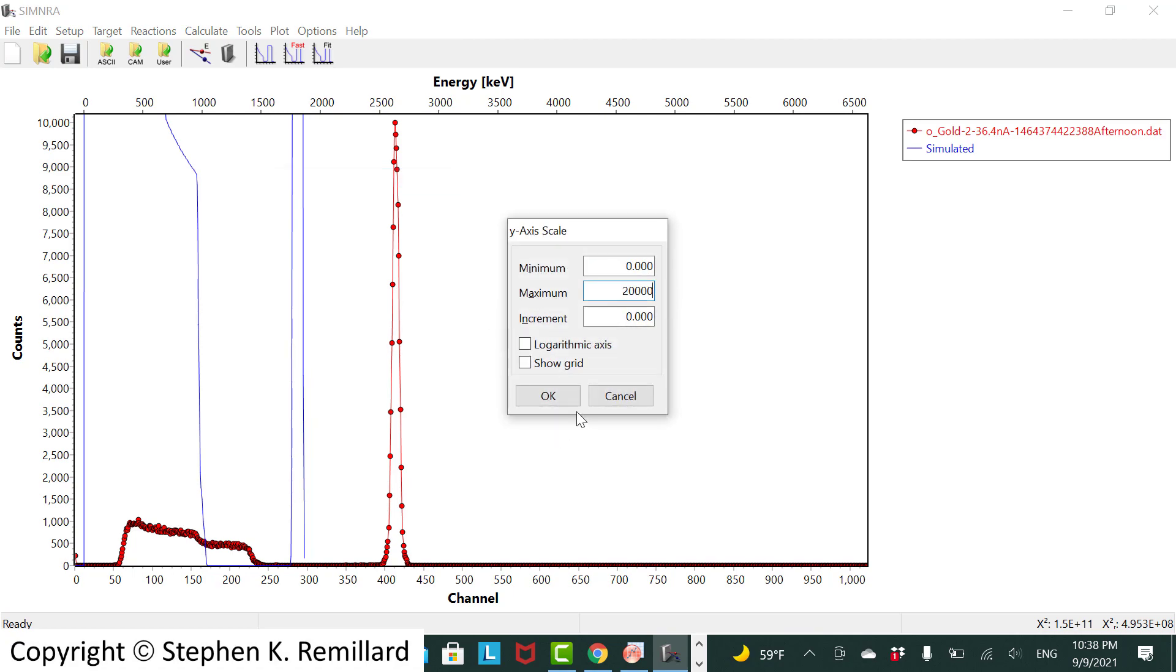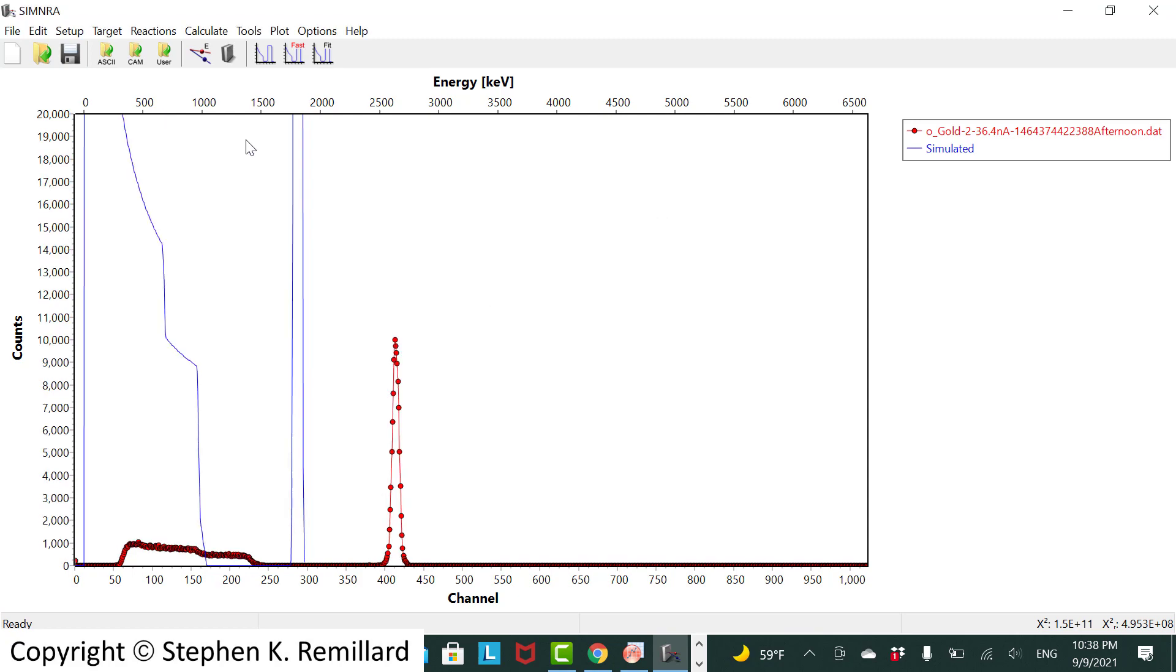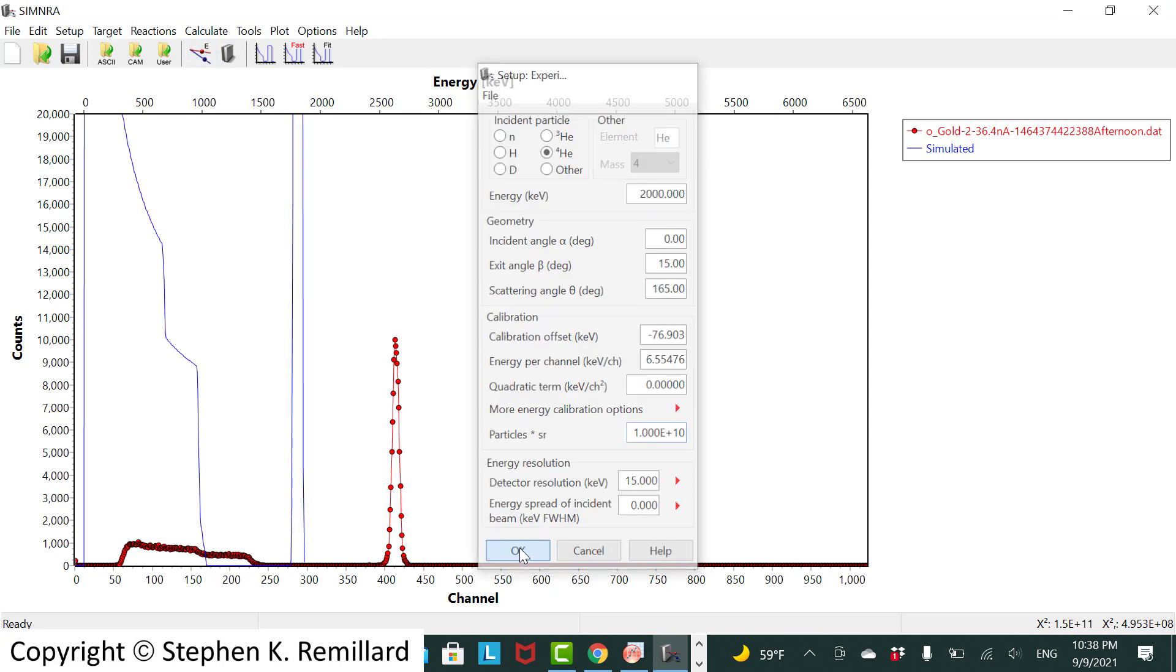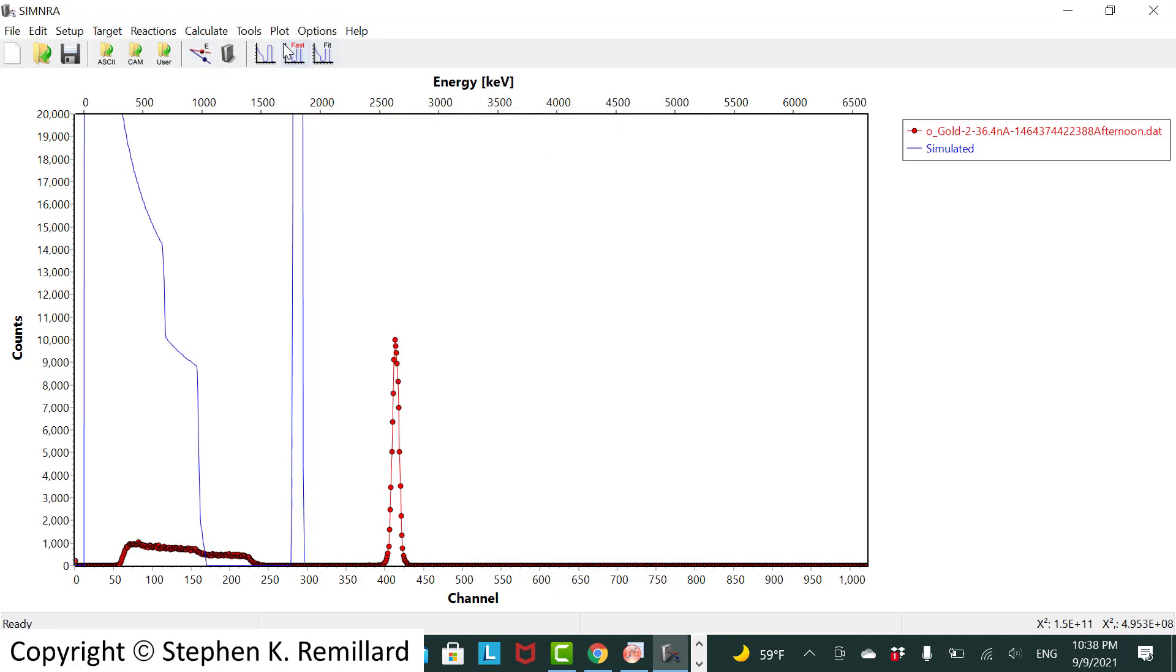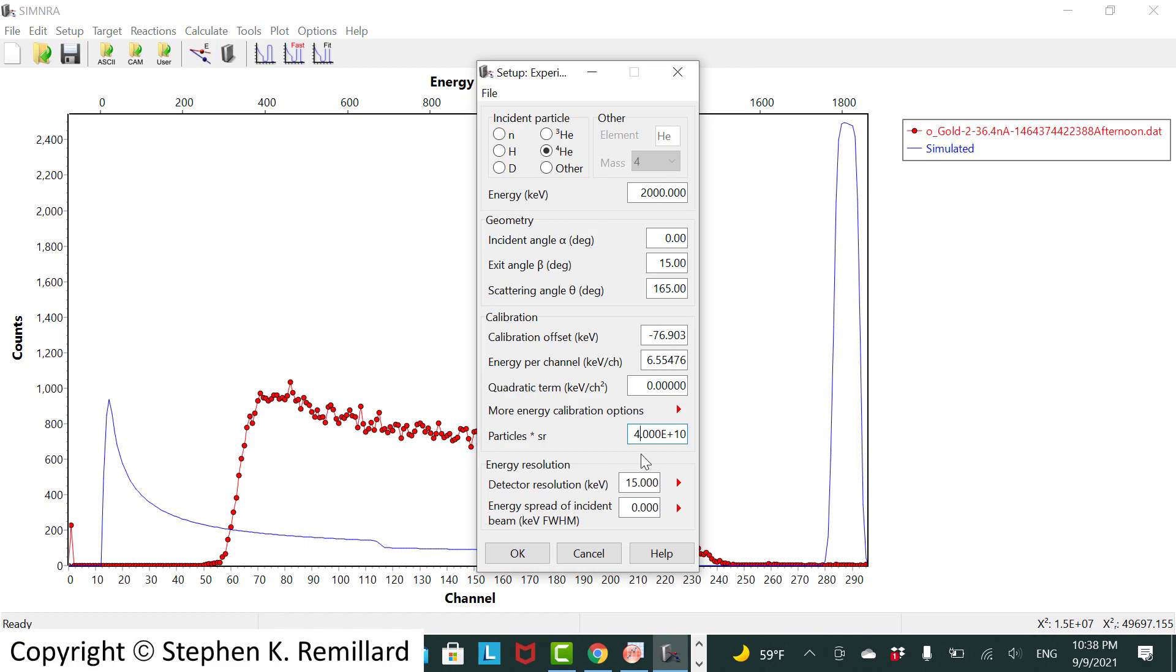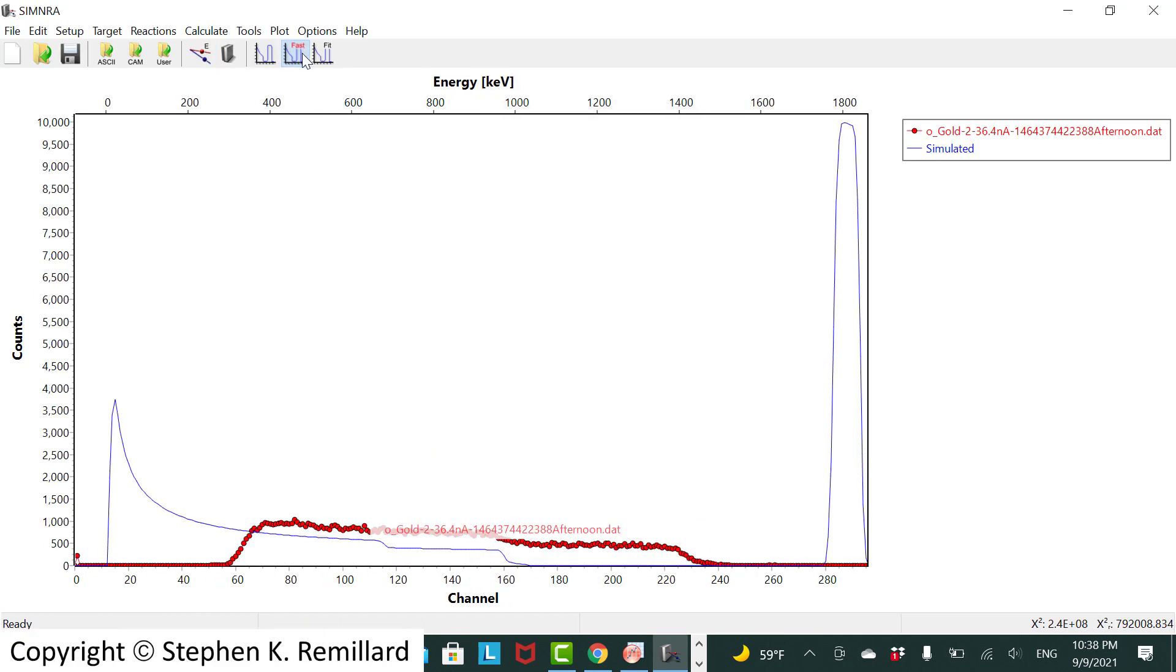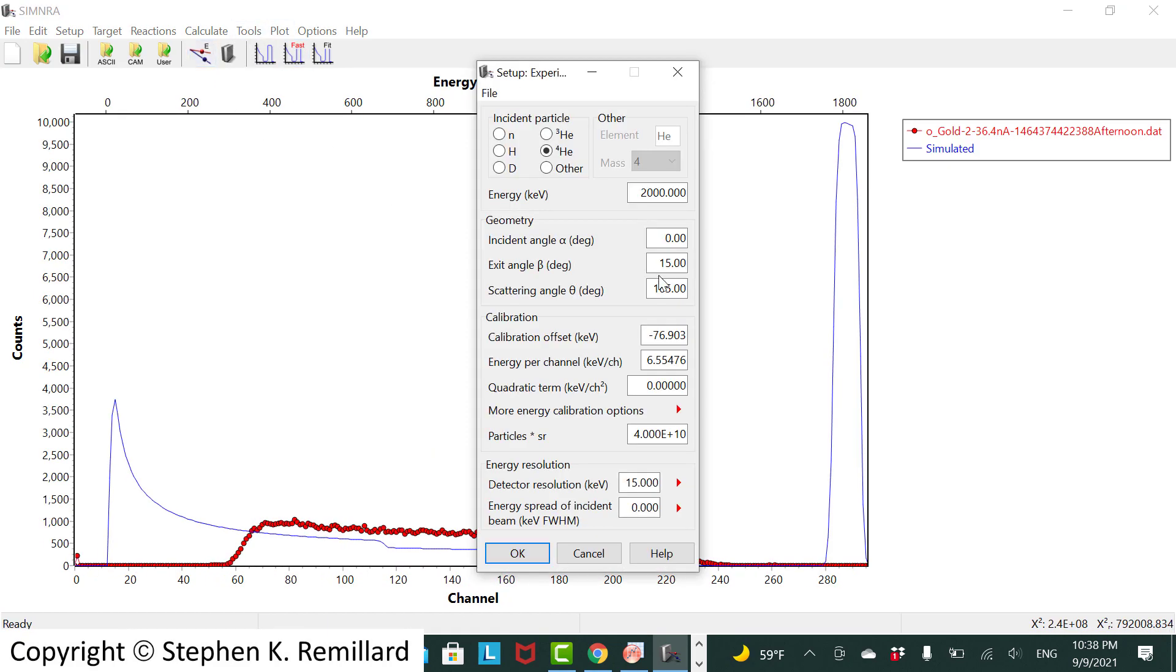And clearly it's way off. A few things need to be adjusted. The particle steradian gets it down somewhere we're supposed to be. And our gold peak is out here someplace. So our energy is way off. Normally we're around 3000 kilo electron volts.